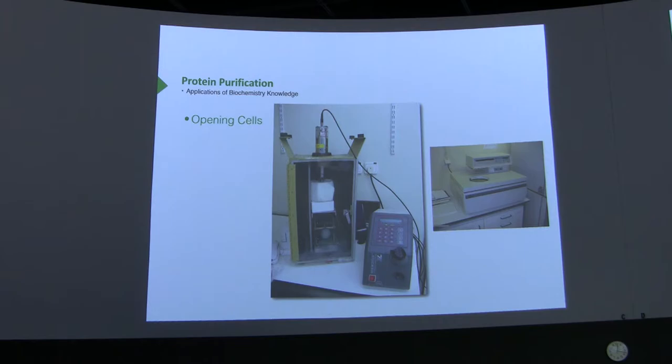So there's a variety of ways of getting at things. Sometimes we use enzymatic means. It doesn't really matter. But the important thing is that we're opening the cells up so the contents come out. After we get the contents out, we use typically centrifugation, using centrifugal force, as a way of separating the big guys from the little guys. The big guys will include things like the membranes, and may include organelles like the nucleus, mitochondrion, depending again, of course, on how we've opened the cells up and what we've done to them. But suffice it to say that the size of the material that we're interested in will have a different velocity in a centrifugal field. And so we can separate things roughly on the basis of size using a centrifuge.